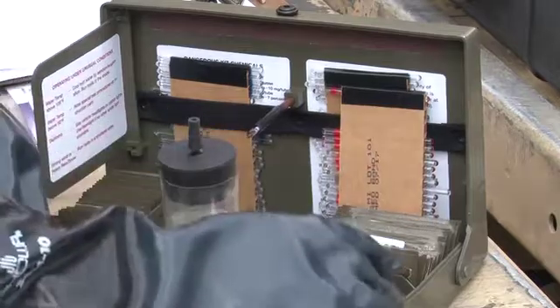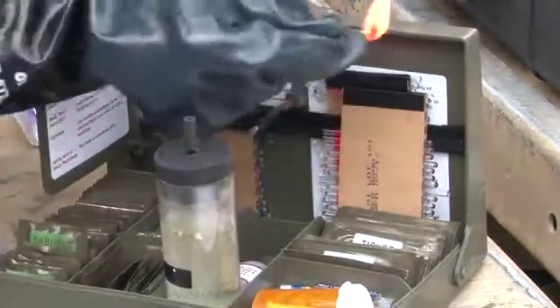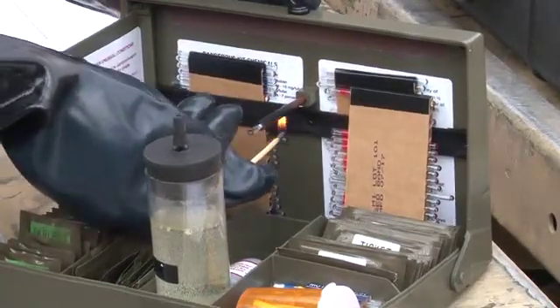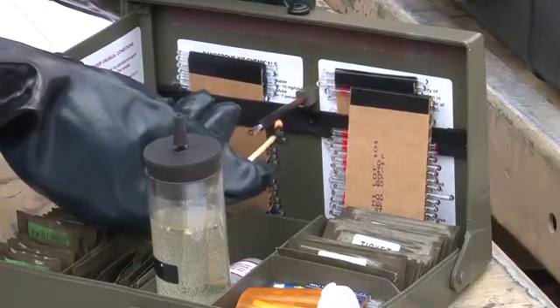Light the match on the striker inside the kit lid. You will now heat the tube holder with the flame of one match. Hold the flame to the metal portion of the heater. Wait 30 seconds after heating.